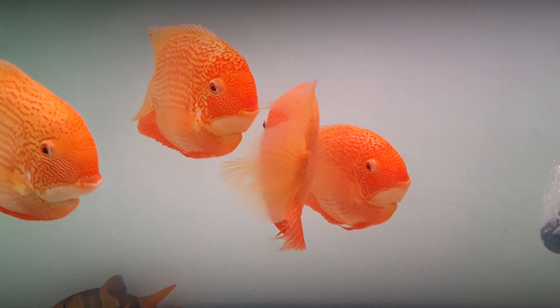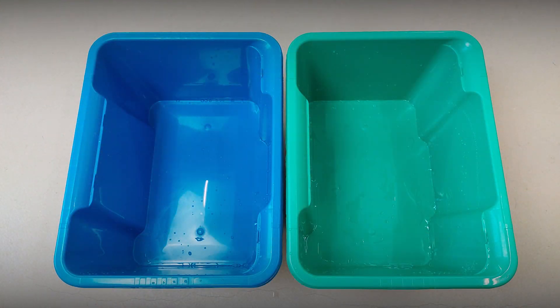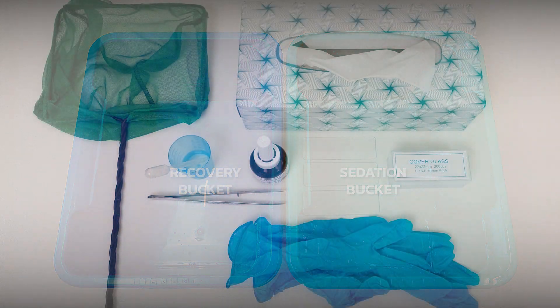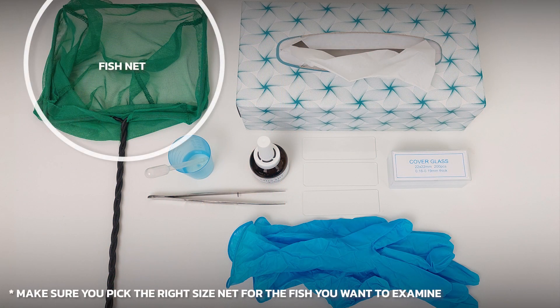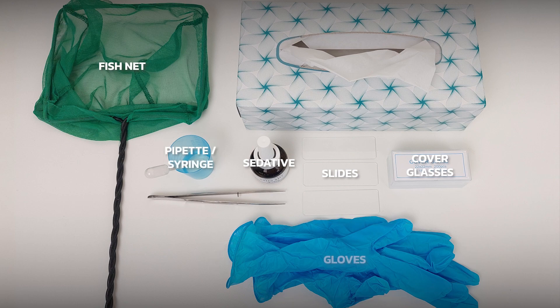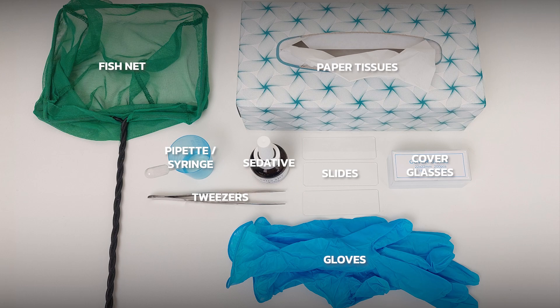To perform a skin scrape, you will need the following tools and objects: two buckets or containers with a lid to temporarily hold the fish — one for sedation and one for recovery — a fishnet, standard sized microscope slides, cover glasses, sedative if possible, a pipette or syringe, gloves, tweezers, paper tissue, and a well-lit workstation.